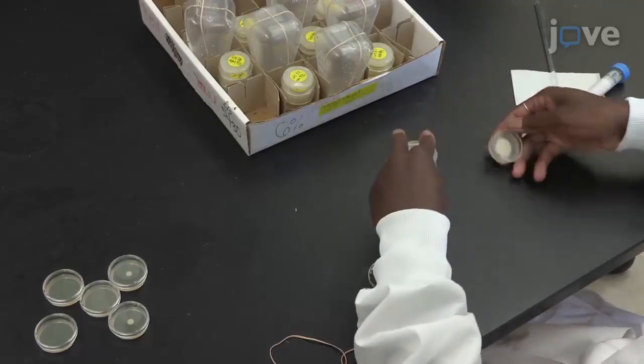Laying chambers likely requires one to begin building population numbers several generations prior to the planned experiment. Now, change the apple juice agar plates twice a day, once in the morning.